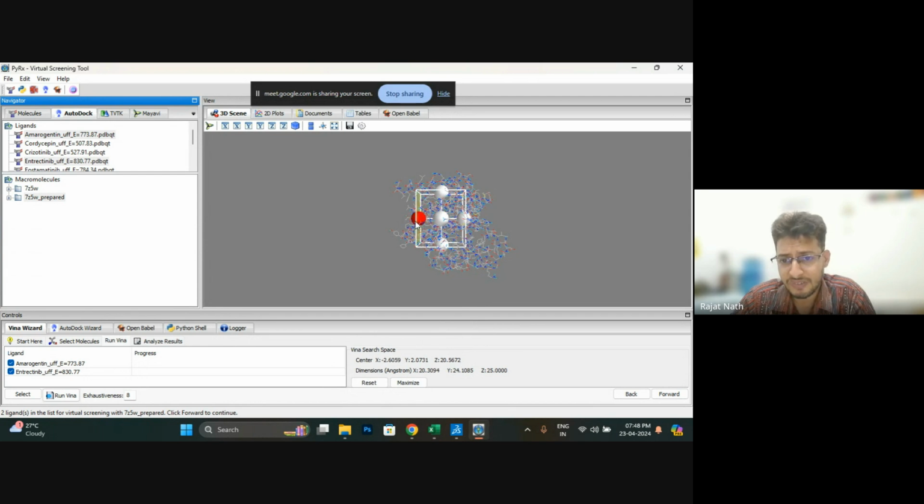So what will I do? I will see which one changes the z value. So this one is changing the z value. As I said, my z value is 22, so I am just making it 22. The y value was 19; let us consider it is 20, so I am making it 20.